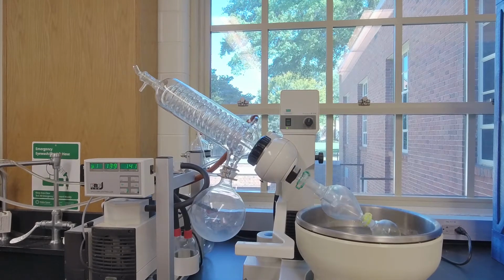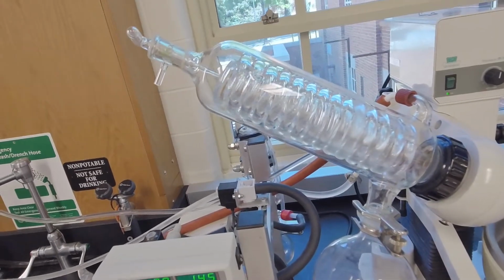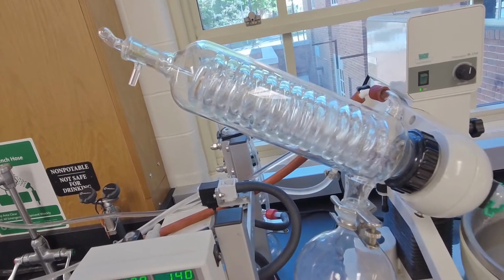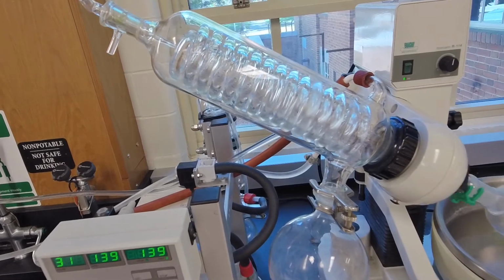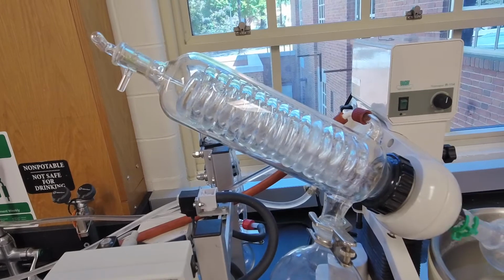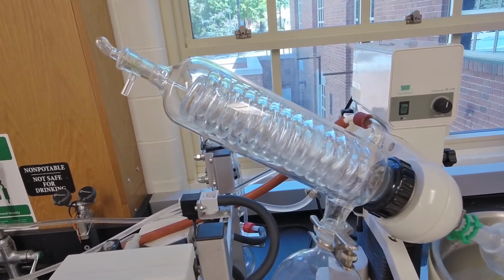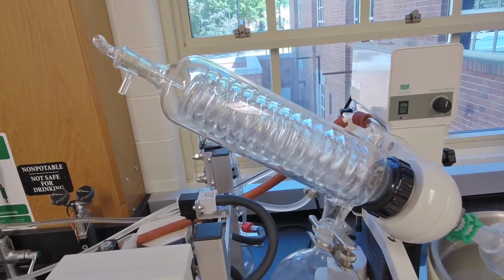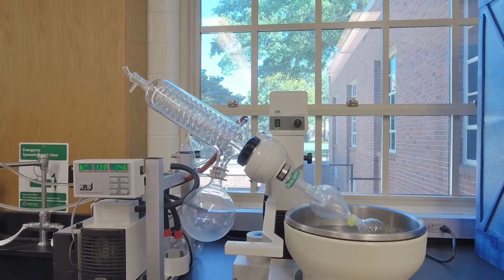Now, I keep hoping we'll see some condensation. This can be a fairly long process. There, okay, so watch the condenser carefully. I know this is like the most exciting TV you've ever seen, right? You can see liquid starting to condense on the condenser. I have no idea how well this is coming off on camera. There you go. There you got some. All right. It's not the most efficient condenser in the world, so it probably is going to miss some.